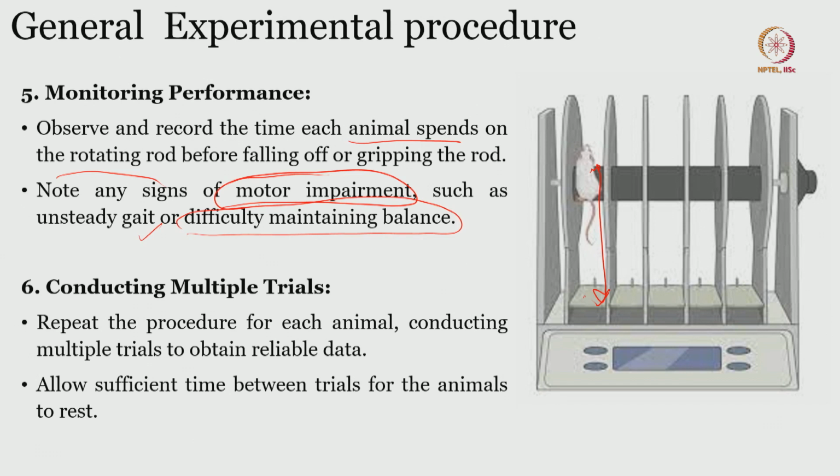So, you need to make sure that you conduct multiple trials. As I said, there is a huge spectrum of any behavior that you are trying to study. So, you need to get the average of the entire spectrum to say yes, there is a significant change based on your intervention, or for that matter even the manifestation of Parkinsonism.